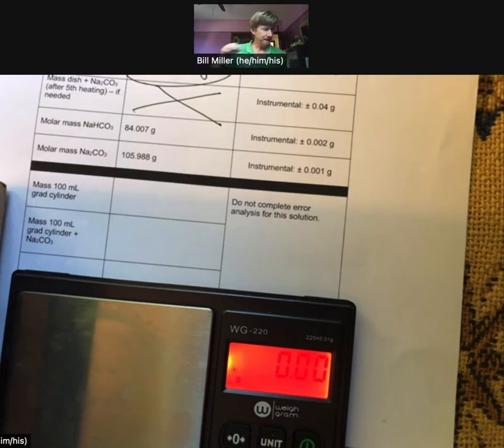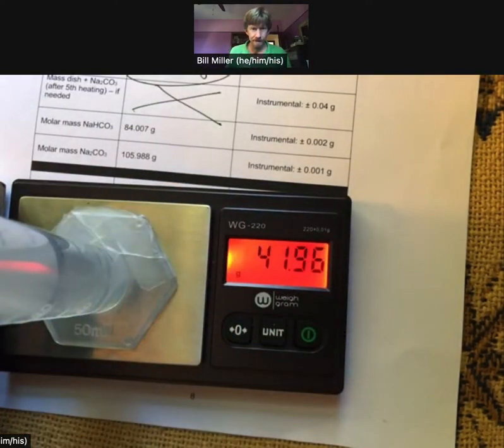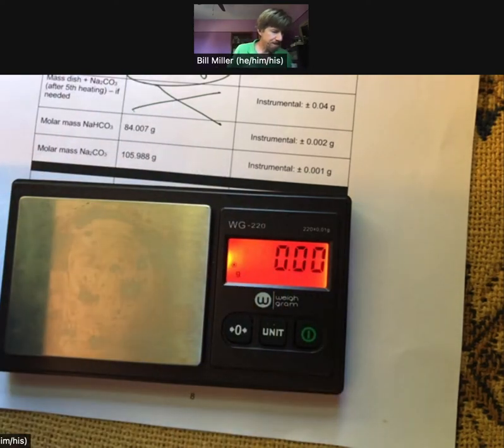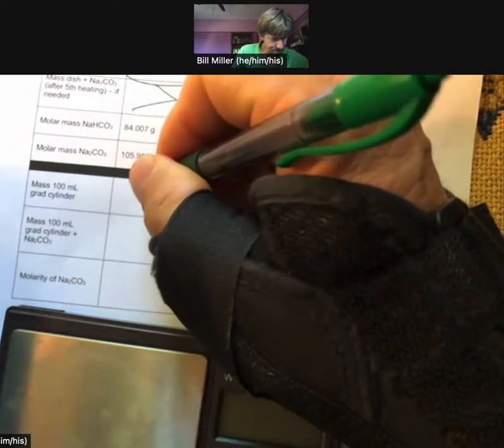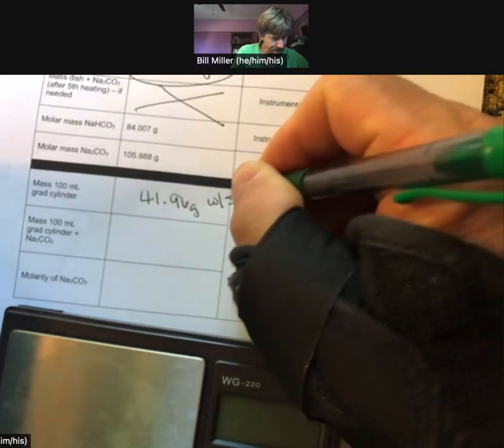Oop, don't spill anything on the nice computer, please. Looking at this. Let me wait for my dot to appear first. There we go, there's my dot. 41.96. That's going to be my first number. And I'm going to make a note.